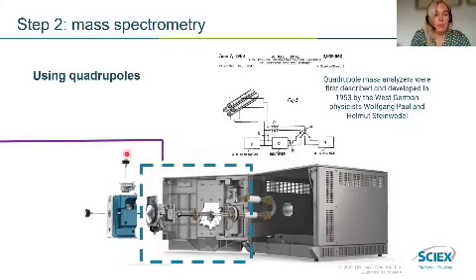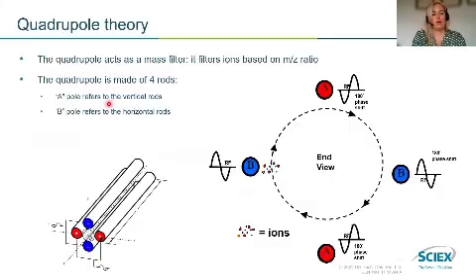We've now looked at our ionisation at the source, so we're going to go further back into the mass spec and look at our quadrupoles. So what are our quadrupoles? As you can probably guess by the name, quad, 4. So we've got 4 rods, and these 4 rods have opposite polarities.